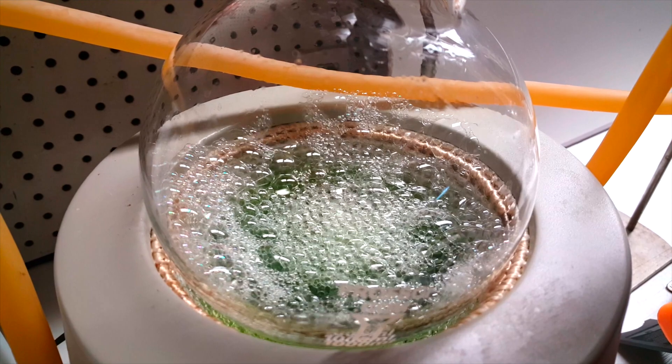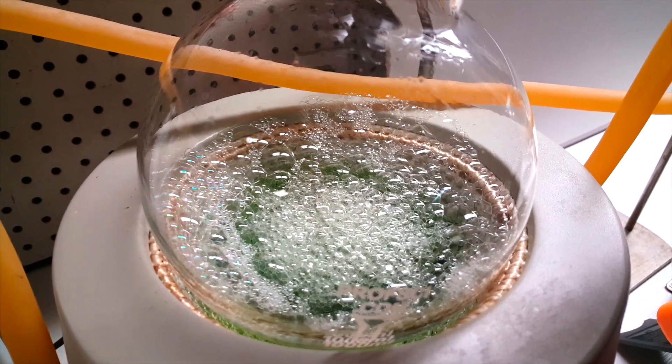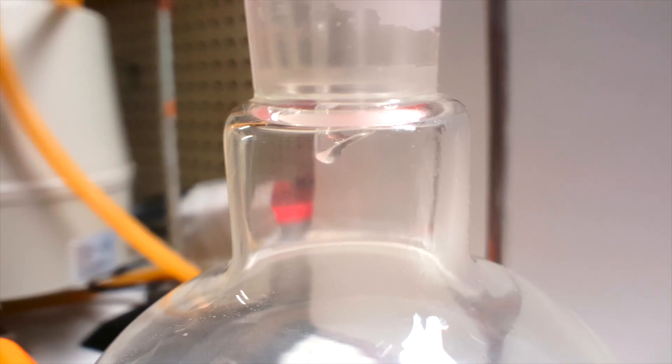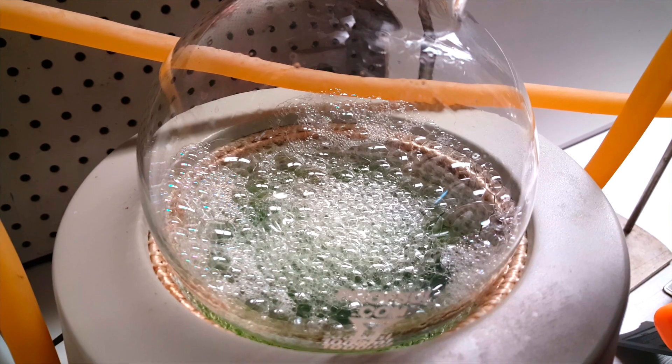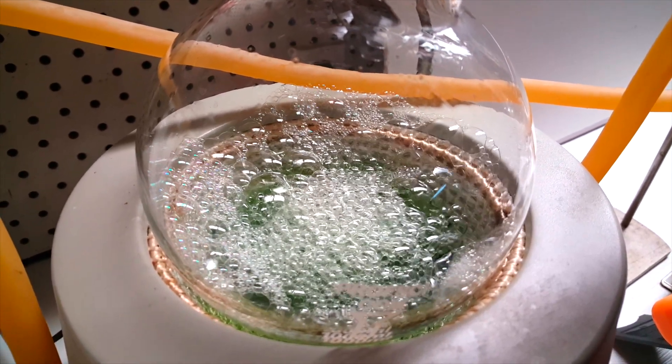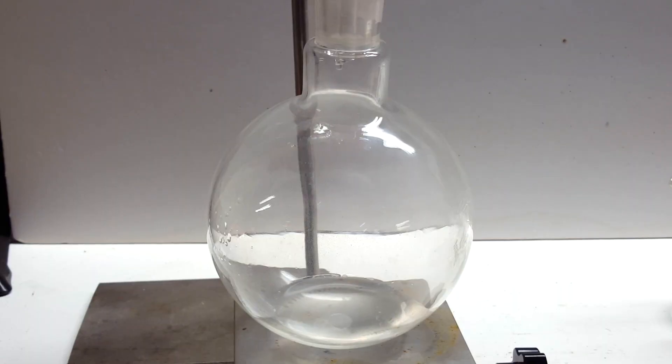Eventually, I got the solution boiling at around 106 degrees Celsius, and I was distilling over some dilute phosphoric acid. I turned up the heat quite a bit, because the foaming was not an issue anymore, and I kept collecting the phosphoric acid containing distillate. The temperature of the flask continued to rise to about 130°C where it plateaued, with still a nice drip rate of distillate coming through the receiving flask.